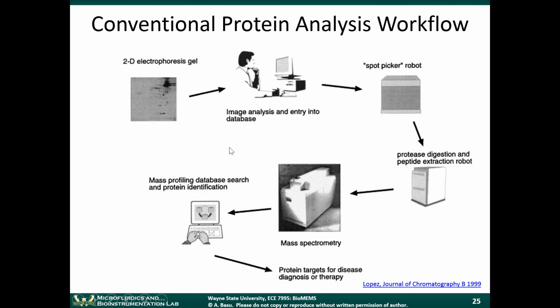So I'm going back to this slide. This is kind of an old slide, but it's trying to give you a perspective in terms of what the life scientist is doing, and where these analytical techniques are being used. One important application is this thing called proteomics. I don't know if any of you have heard this buzzword before, but proteomics is the study of proteins, for example, how much protein a certain cell is secreting.